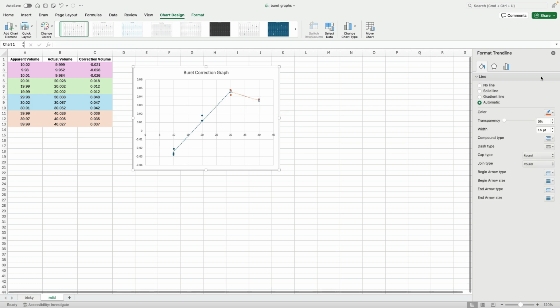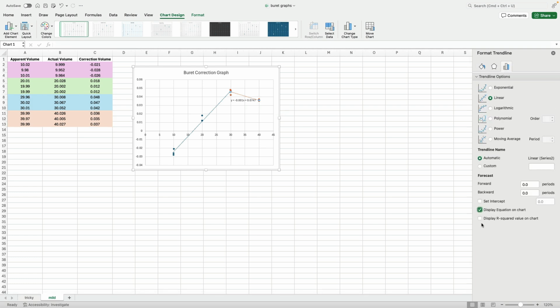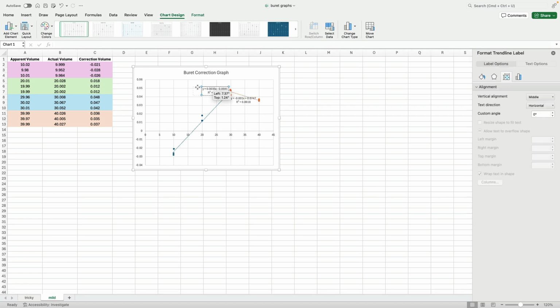And of course, we would want to put the equations on here for each of the trend lines. Okay, so you could say, well, how did you know where to break them? Look, it really depends, and this is why I have you start off with all the data. It really depends on what your graph looks like.